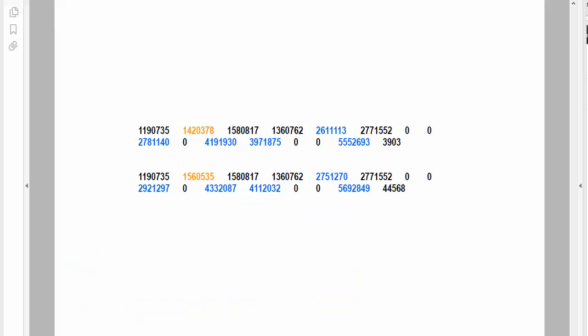If we find the two corresponding 4 subgroup partitions in the data structure, subtracting a methylene from the orange subgroup of 44.568 will shift not only that mass, but all of the blue colored masses that have that orange subgroup in them. To do similarity searching, the subgroup masses can each be sequentially shifted by some delta mass, and then that set of partitions and partial sums can be compared to the fragment masses. Currently, only 7 specific mass shifts are used. These masses are targeted to food and environmental studies. So for example, methionine enkephalin would not be found as a similar structure.